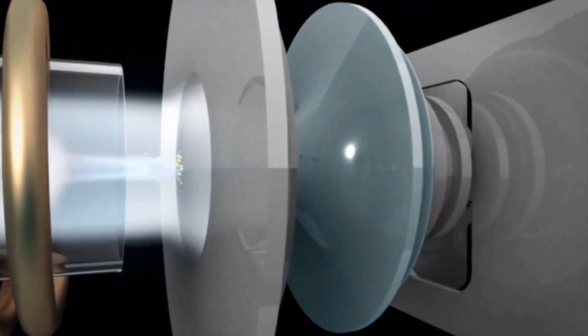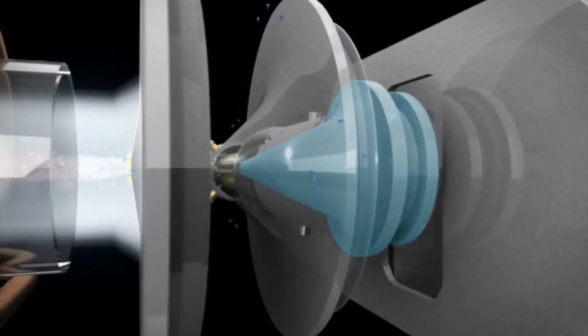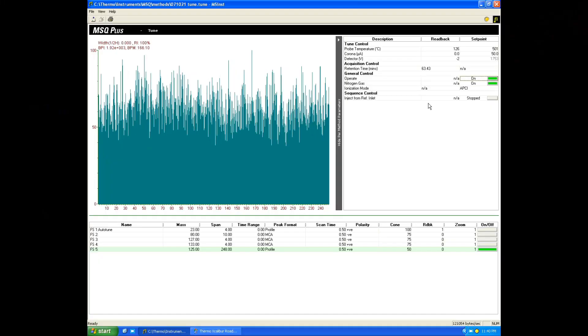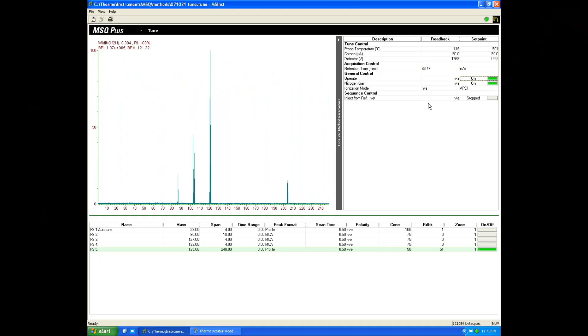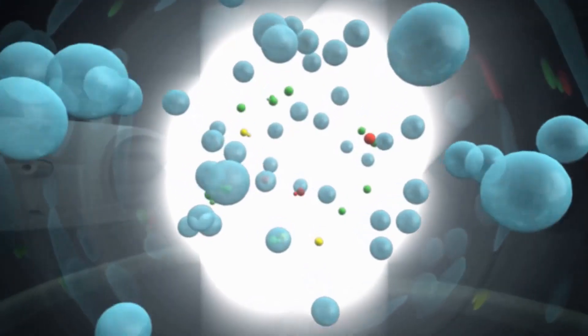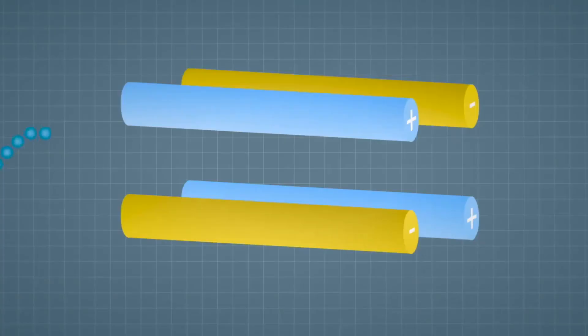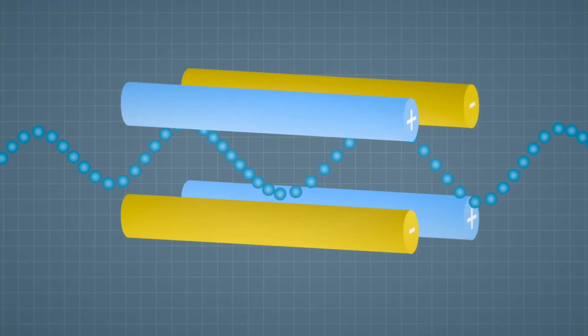In electrospray mode, the sample passes through a nozzle held at a few thousand volts and is ionized in the mist in front of the sampling cone, also held at a high voltage. Voltage, current, and polarity can be set in the software. Inside the instrument, the ionized particles travel in a vacuum, passing through ion lenses before entering the quadrupole — a four parallel metal rod assembly held at AC and DC voltages.